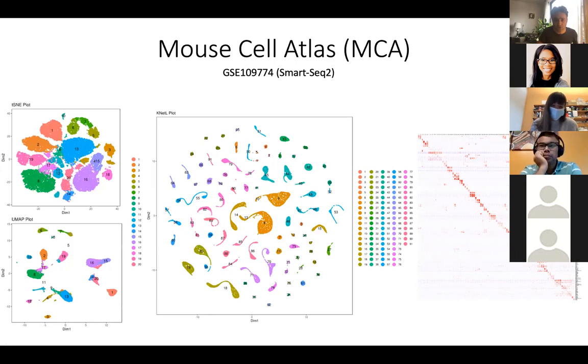So in the middle, you see the KNetL map. This is, I guess, a zoom of 200 on this data. You can see there are about 91 clusters right off the bat, and after finding the markers for them, they all have kind of clear markers for each of these clusters. So it really helps with time of analysis if you have large data.